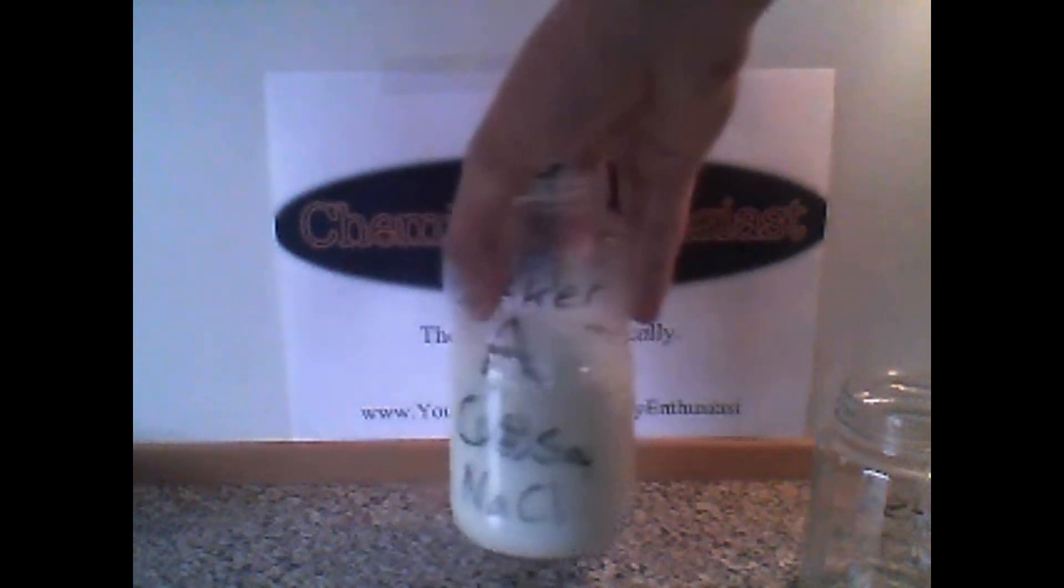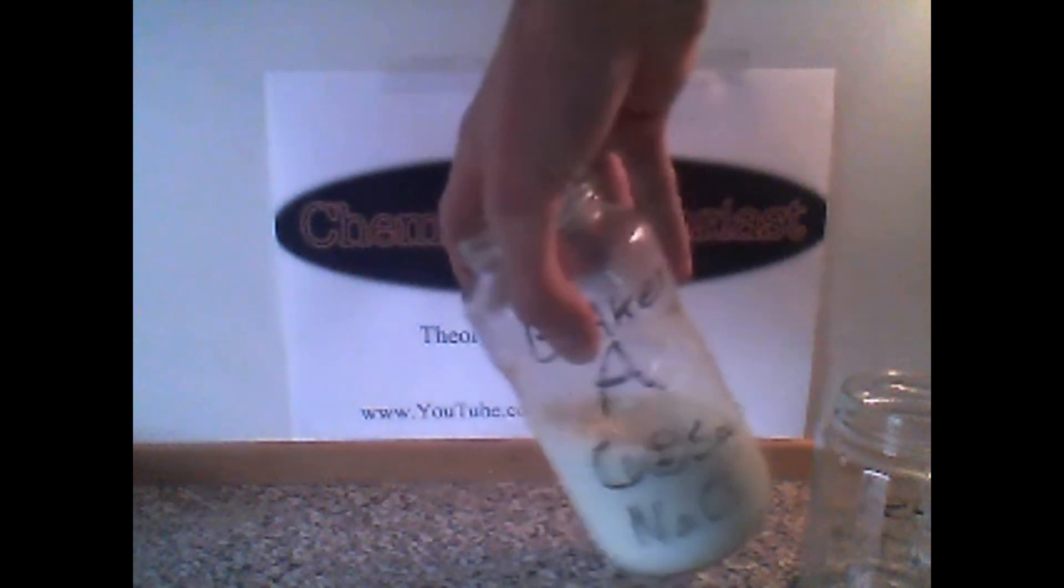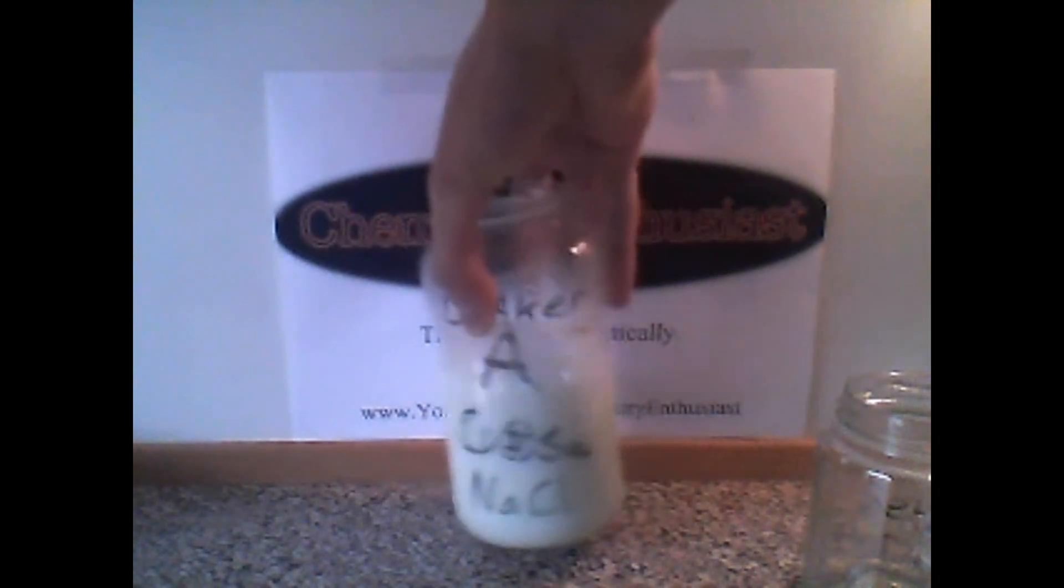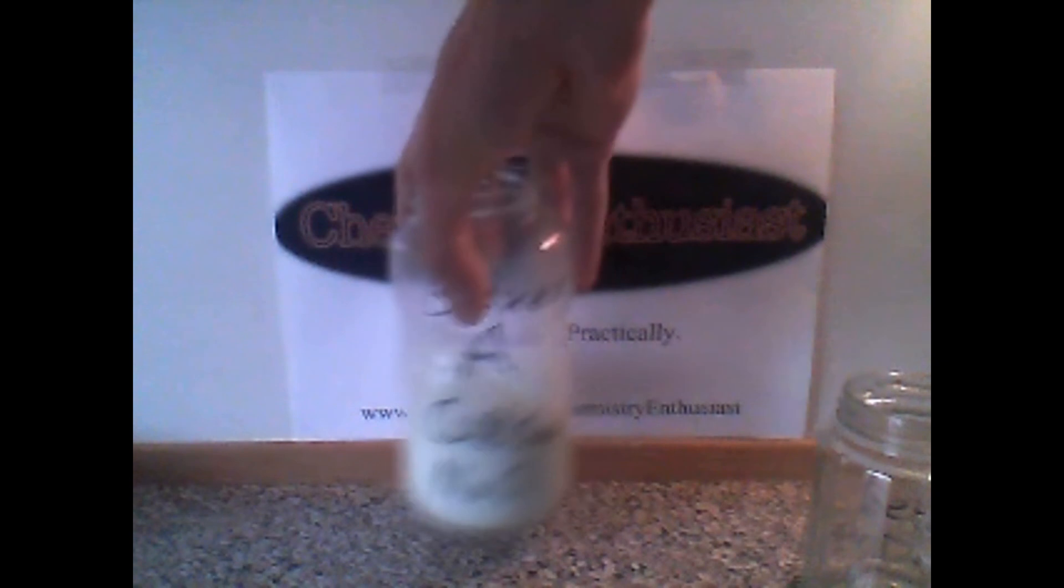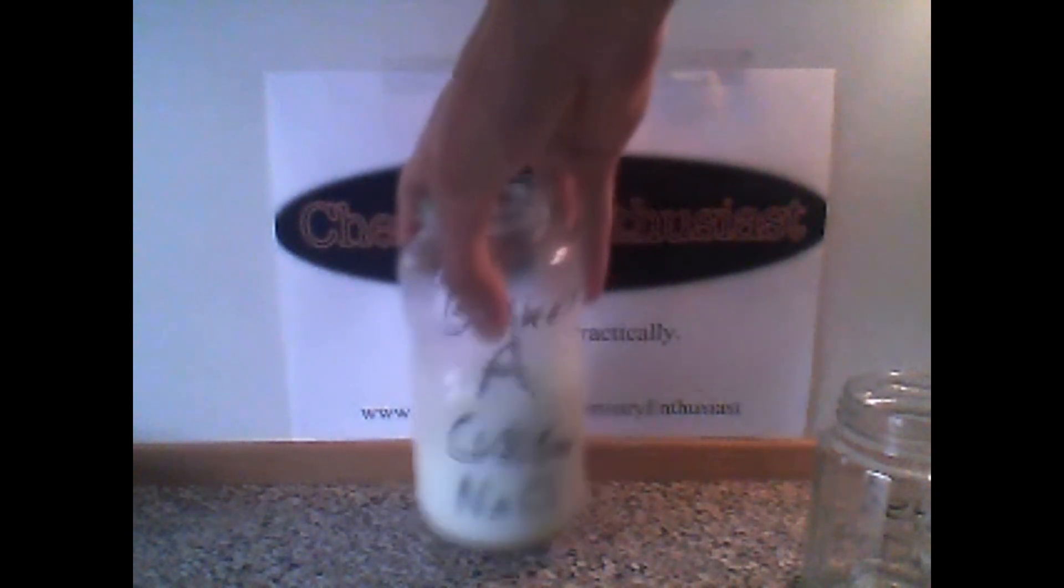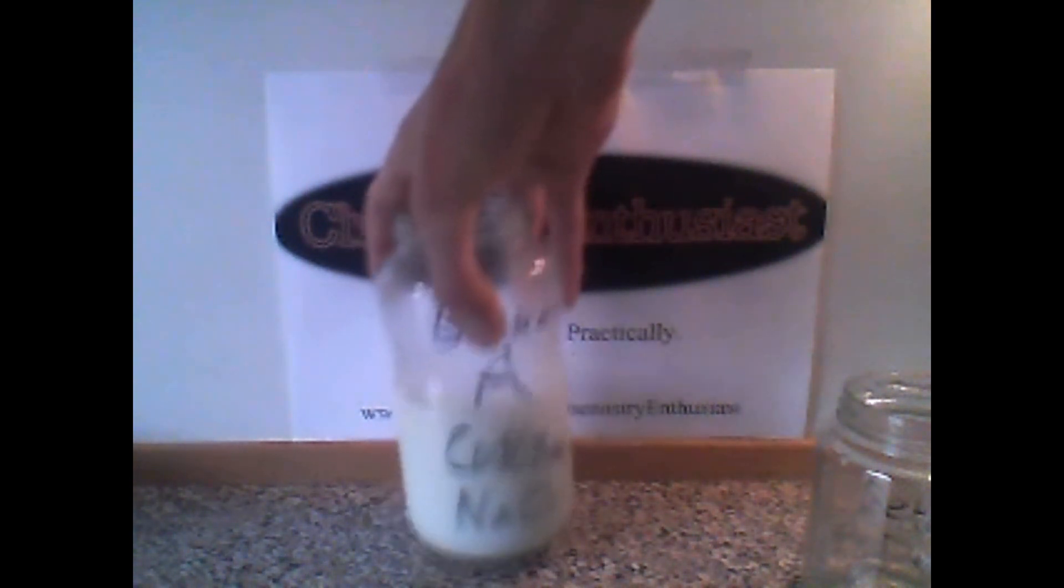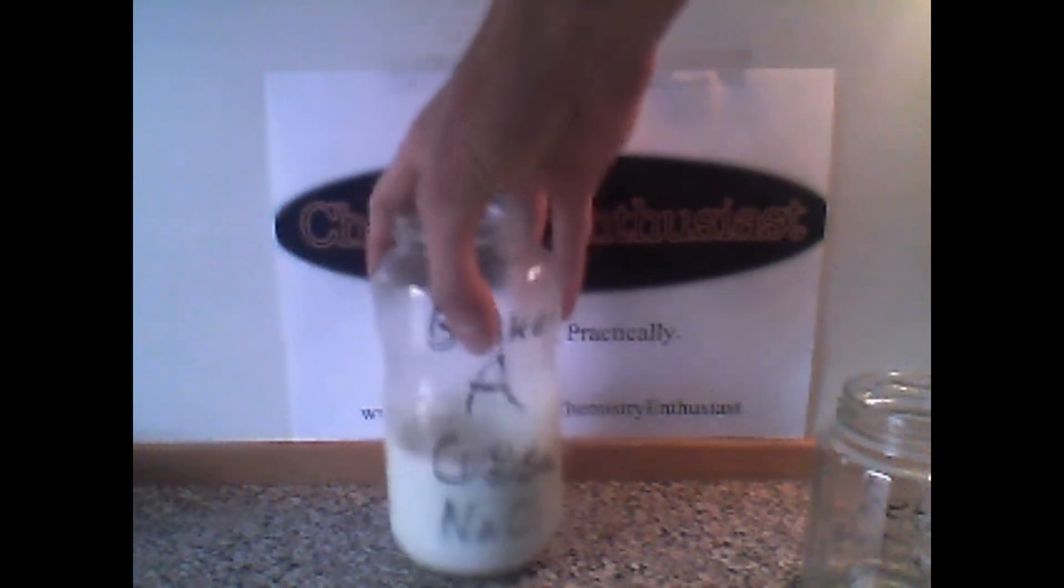Which will be white as you can see here. Make sure all the chemicals have reacted. Stir it up quite well.